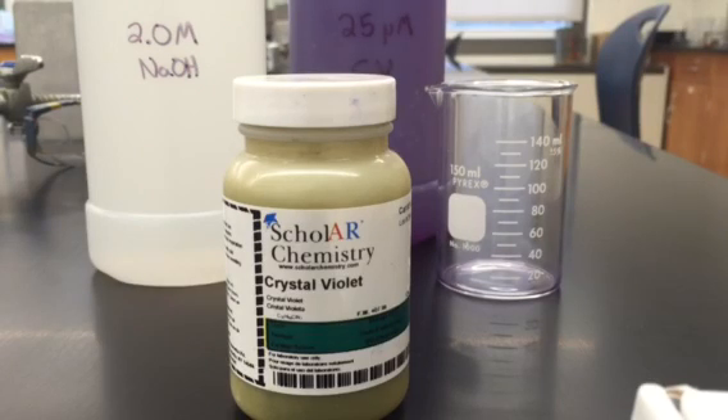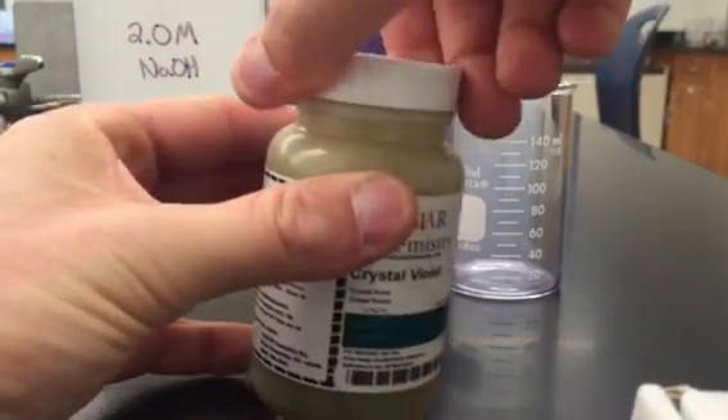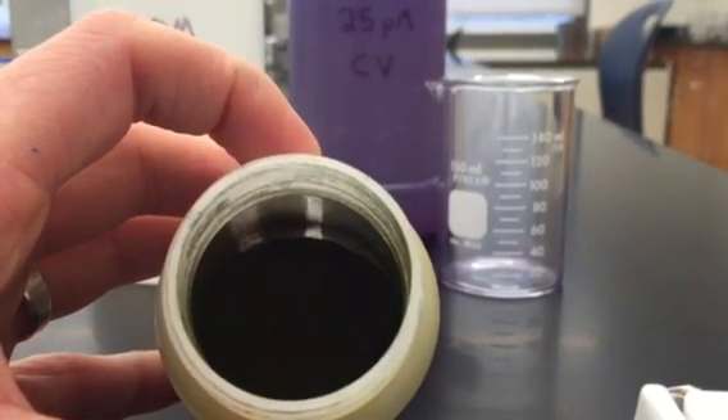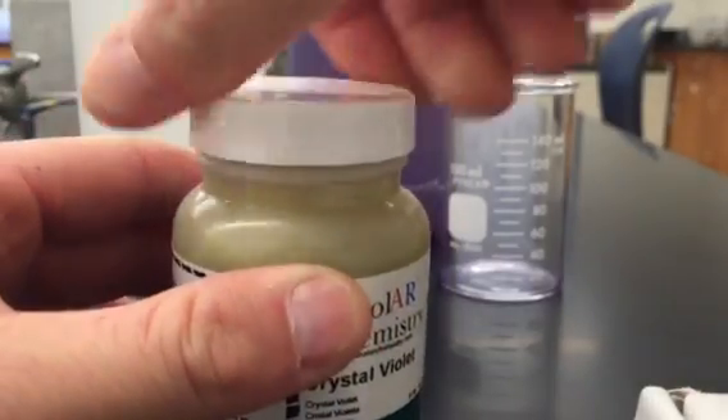The following video is to demonstrate the reaction of crystal violet solution with sodium hydroxide solution. The crystal violet solution was made with crystal violet powder. Crystal violet powder is a kind of goldish purplish substance, and it requires very little to make a solution.